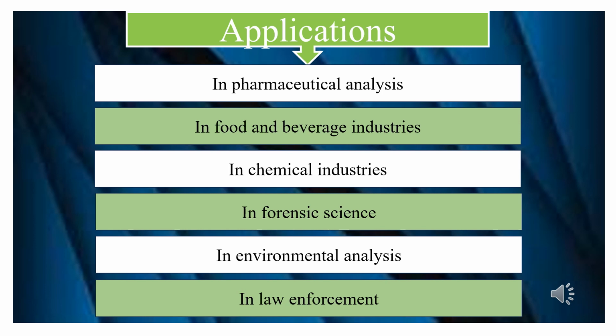Then the proteins of interest might have to be isolated from other proteins and purified further. And chromatography is an essential part of almost any protein purification strategy. A number of different chromatography techniques are used for the purification and analysis of proteins. They can be classified according to the physical principle involved in the separation process, and typical examples include reversed phase chromatography, ion exchange chromatography, affinity chromatography, and size exclusion chromatography.